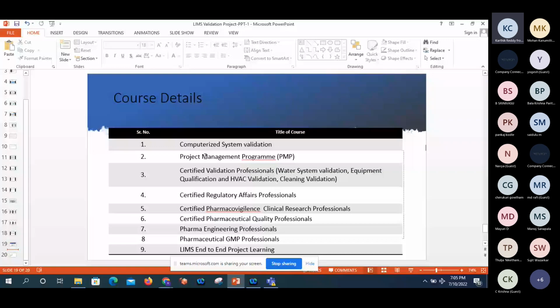Karthik, sir, I have one doubt. Actually, in the LIMS software, for example, today I have a night shift. Before 12, I opened the LIMS. After 12, continuing, I have given the standard entry. But the date does not change, sir.